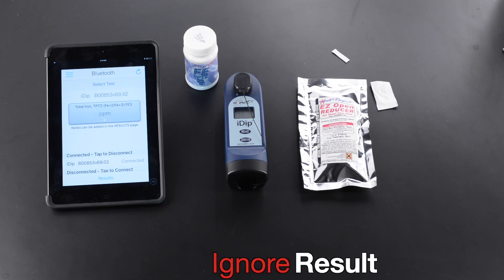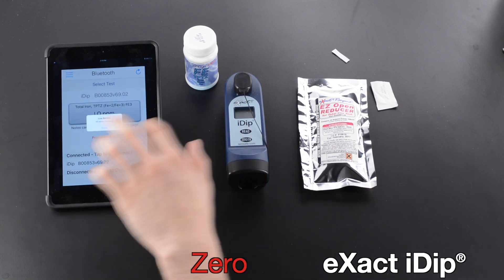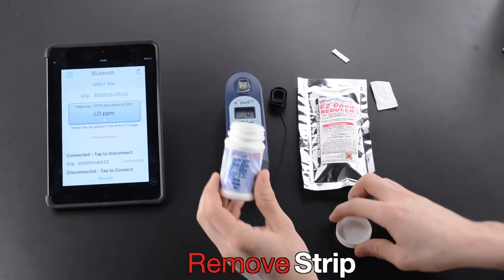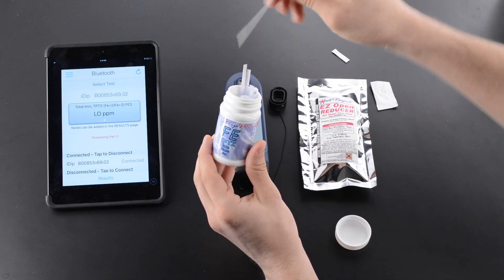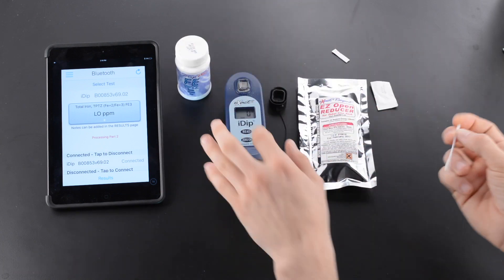Ignore result. Press OK. Zero XactiDip. Remove Cap. Remove Strip. Replace Lid on Bottle. Press Read.